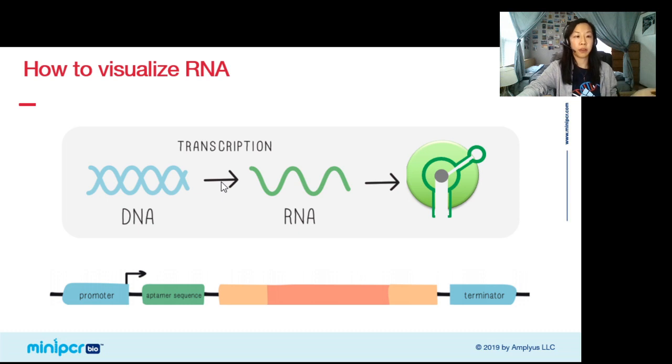Again, keep in mind, this normally does not happen in your cells. Your RNA isn't glowing. The rest of the RNA, in fact, is not folding up and glowing. It's just a special trick we engineered in this lab in order for you and your students to be able to see RNA.